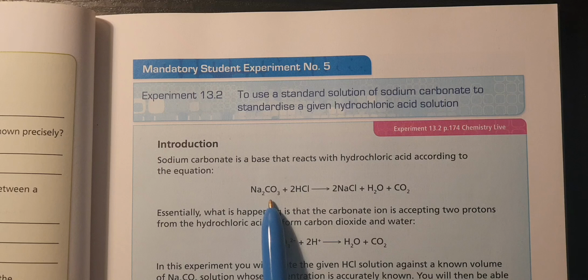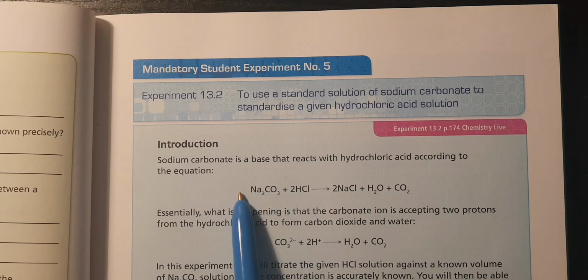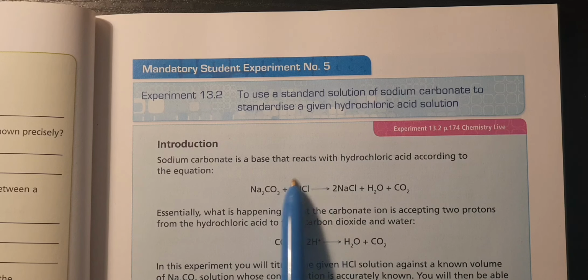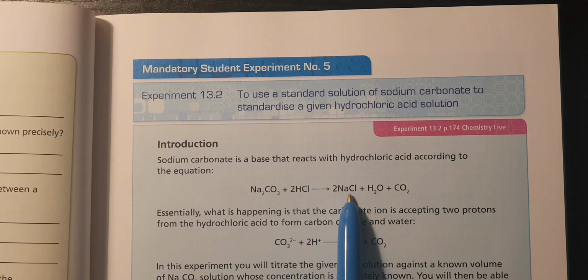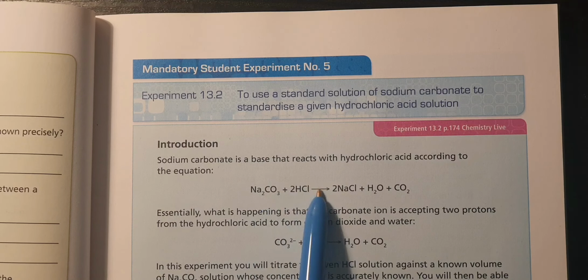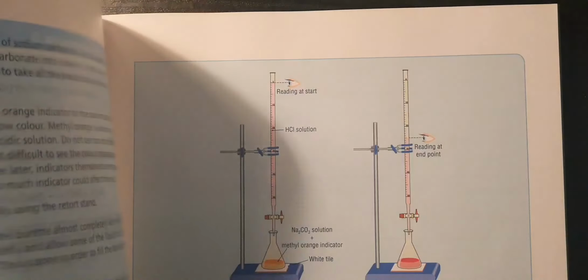This is our chemical equation that we're going to use. So we're titrating this sodium carbonate against our acid HCl. That produces salt, water and carbon dioxide. So acid and a base usually produces a salt and a water.